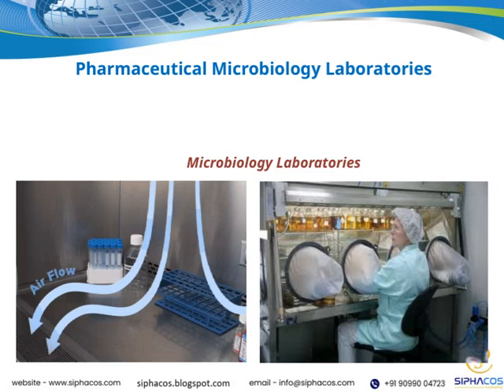Now, let's turn our attention to pharmaceutical microbiology laboratories. These labs are a critical component of the overall quality control process in pharmaceutical manufacturing. They are specifically dedicated to testing and monitoring the microbiological quality of raw materials, active ingredients, and finished products. The goal here is to ensure that the products are safe, effective, and free from harmful microbial contamination.